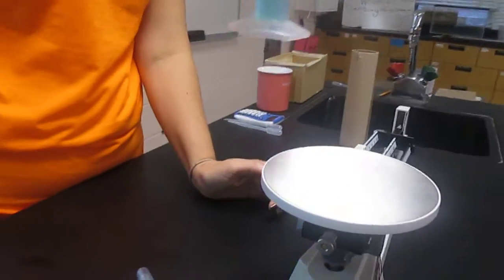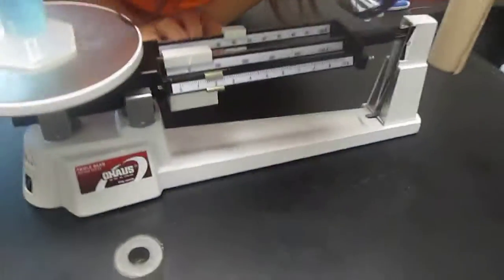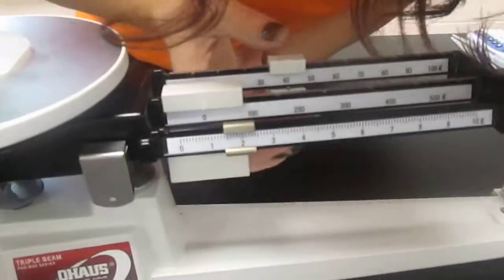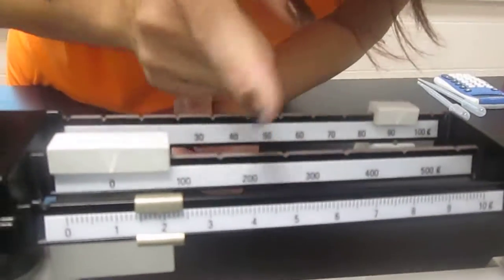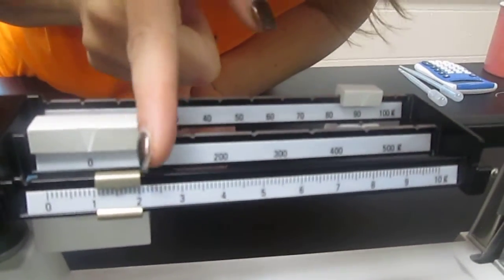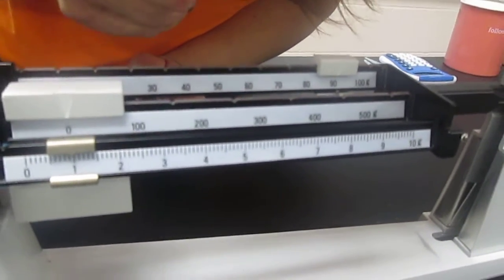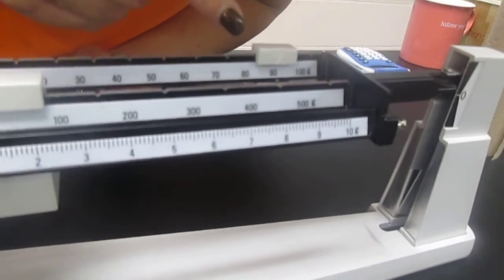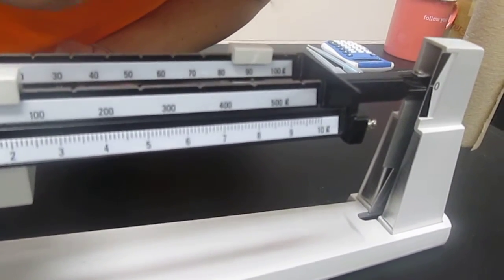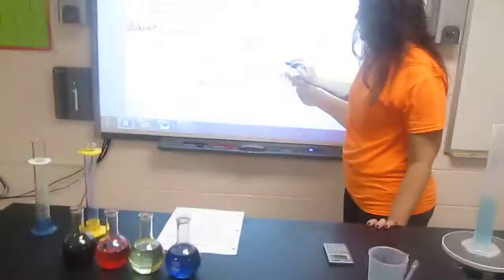So when I put the graduated cylinder on here, 50 milliliters is going to bring me close to here. It's still a little bit heavy. 50. And how are we doing? You think it's close to the right number? Yeah, probably. 90, what does it say? Read it for me. 90.7. So right now it's 90 and 7/10 grams.